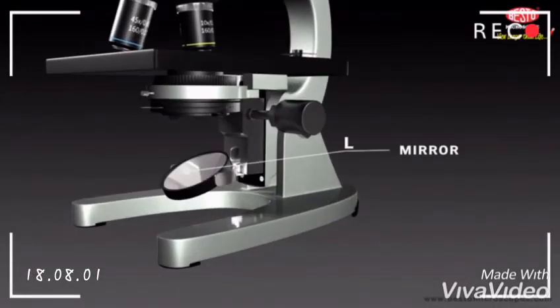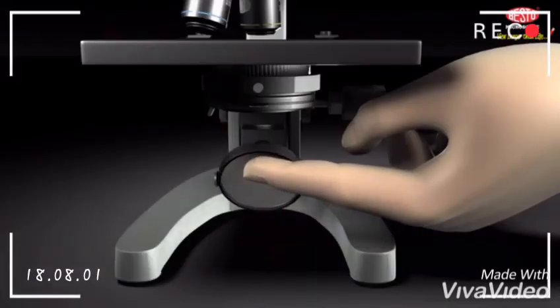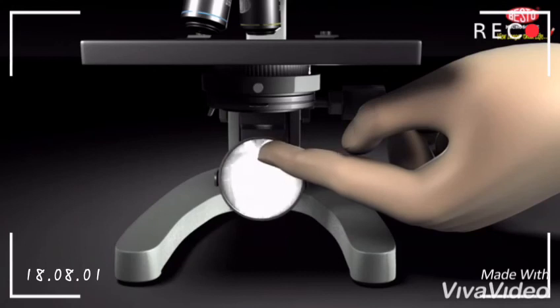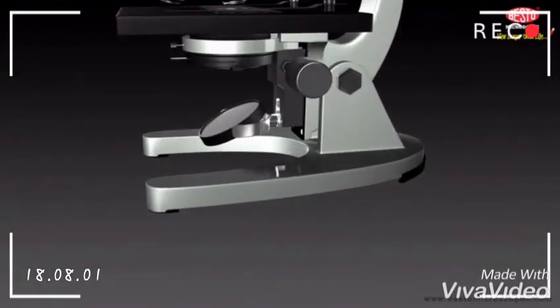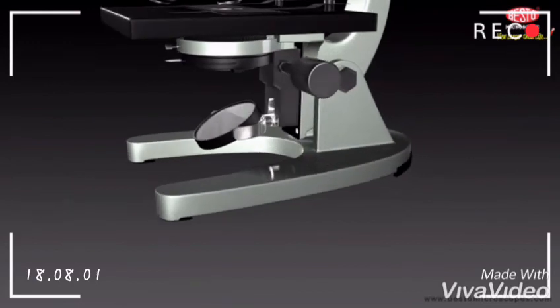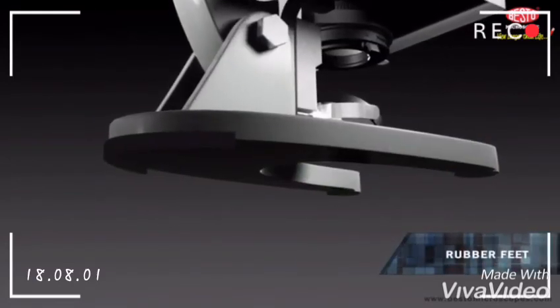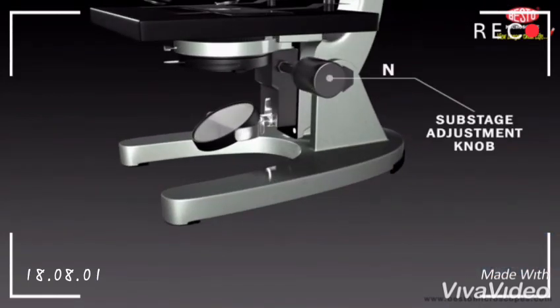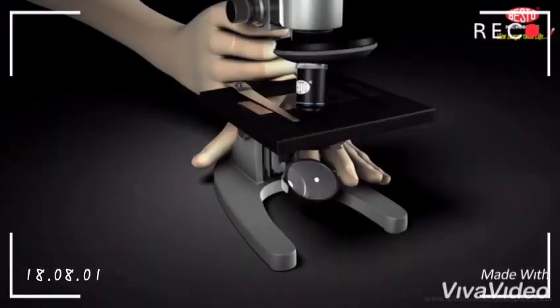The mirror is located beneath the stage, which increases the amount of light shining through your sample or slide. The base of the microscope is the heavy bottom part. It supports all the parts of the microscope. The substage adjustment knob is used to move the condenser up and down.